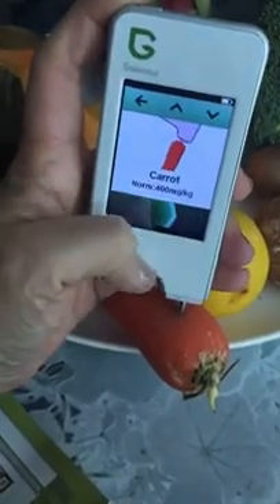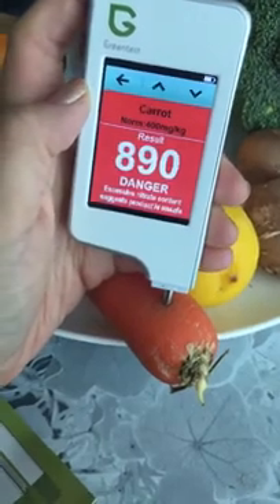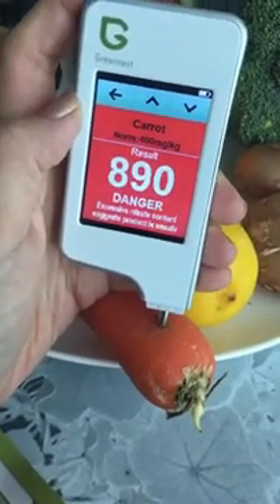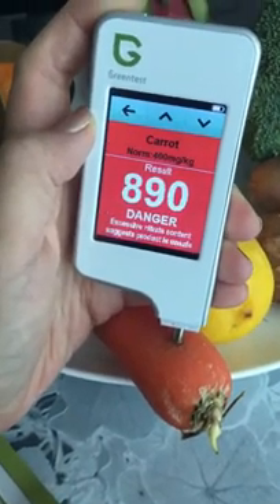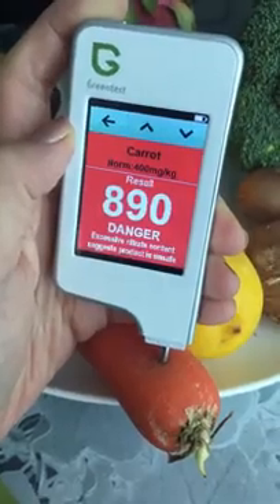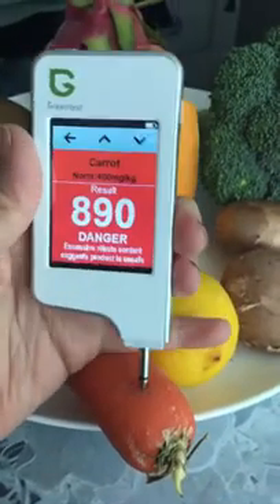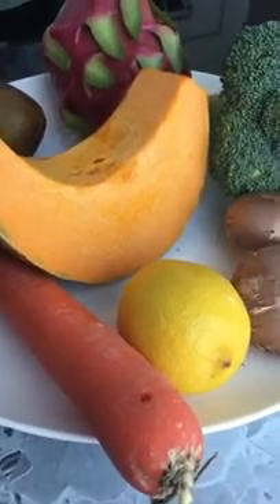Put the probe into the carrot and hit start. The norm is around 400 — oh my god, this is non-organic carrot and it's at danger level! What should I do with this carrot? That's bad news. Let's move on to the next vegetable. I'm cleaning the probe — you need to clean it after every test.